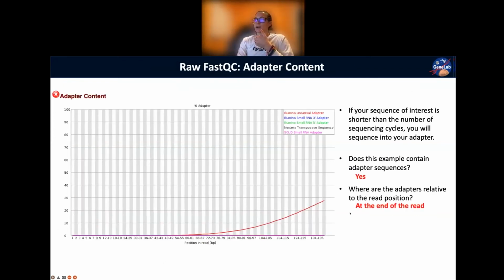we see here, right, at the position at the end of some of the reads, we see an adapter. But you don't see any of that stuff at the beginning. I know we have a little bit of Ns in there, so we might want to get rid of those because we don't know what they are. But all that we would really want to get rid of is anything that we added artificially. So our adapters, right, because that didn't come from true biology.